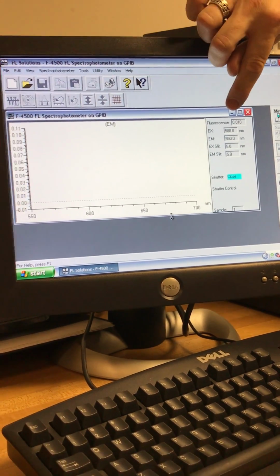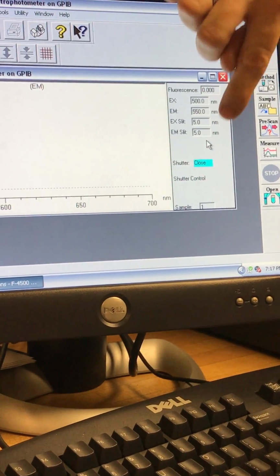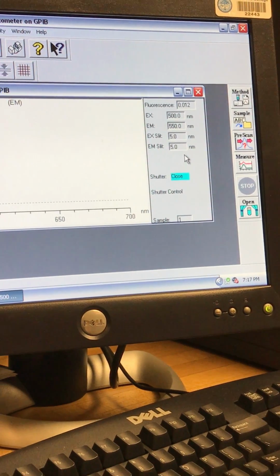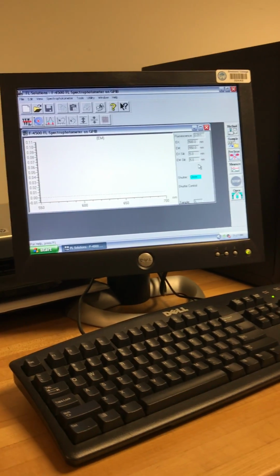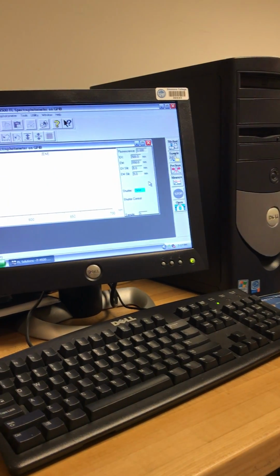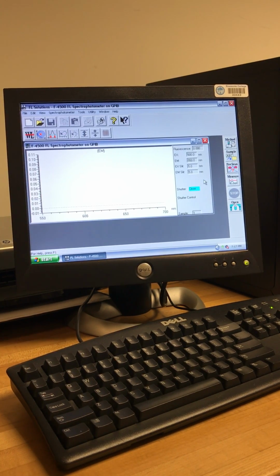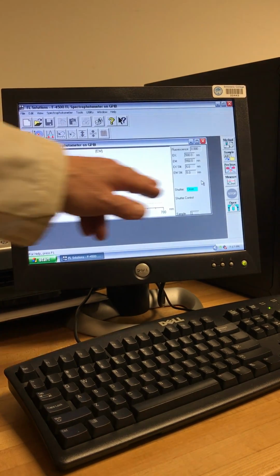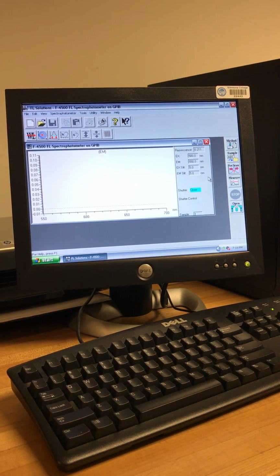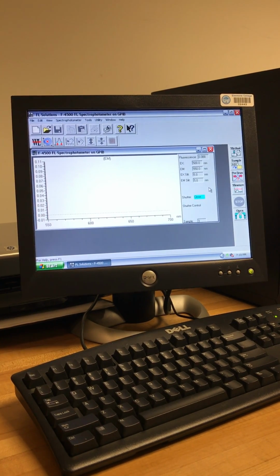So it's setting up those parameters, and you should double check to see that these are here. And the shutter is closed. So once... Just one thing. Yeah, go ahead. When you made that change, it had stop lit up red. So if you're really quick and it's still stopped, it'll crash the program. So make sure that that stop light is not on. That's a good point. Done that. So I think we're ready to get our samples.